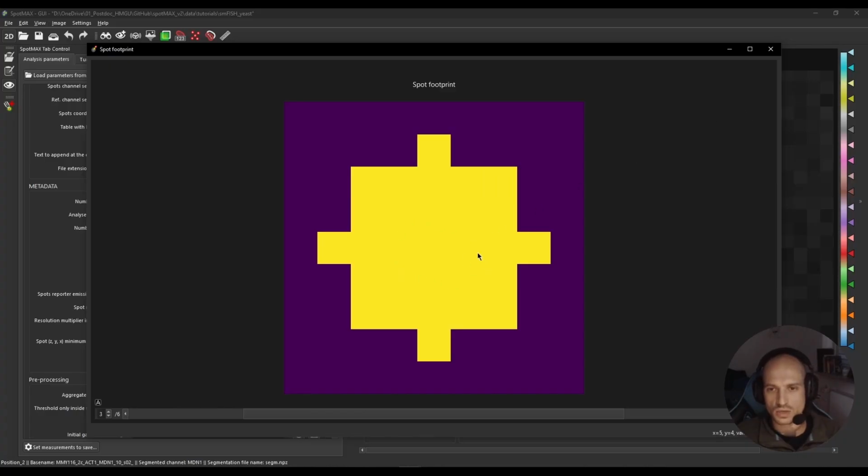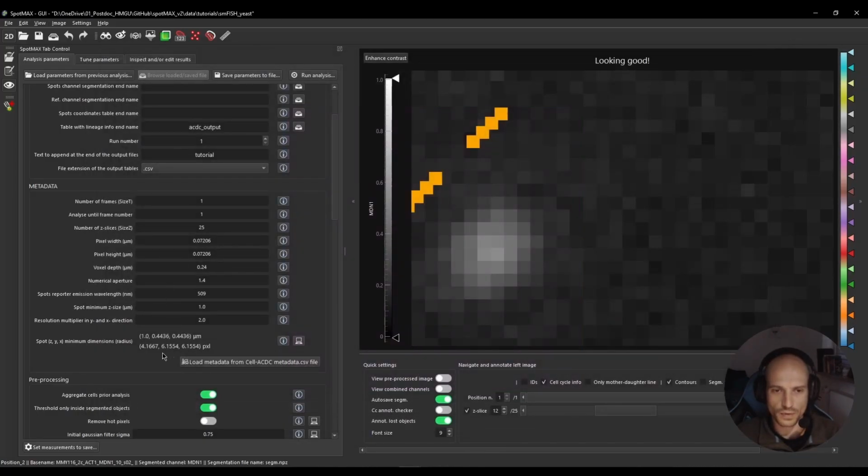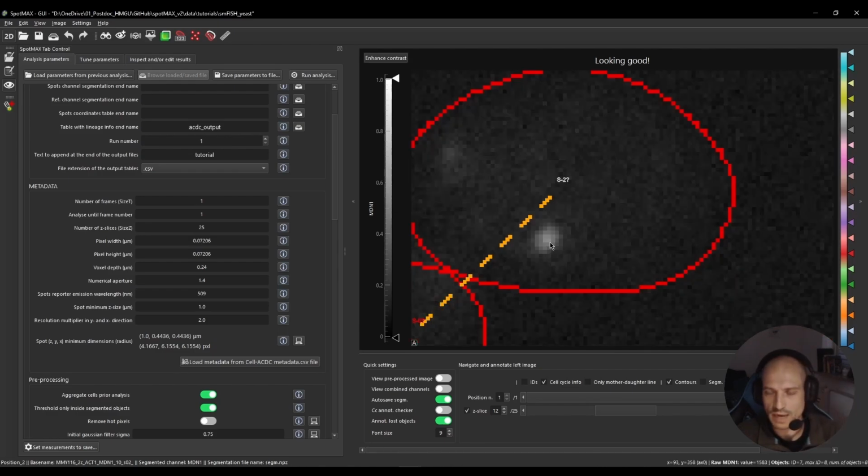And you can see this is actually 6 in diameter because of the diffraction limit. The way it works, you need to go by radius, but you don't have to care too much about these details. And you get this 6. Now, in Z, there is no visual way to do this, in the sense there is no clicking. You have to do it kind of manually.